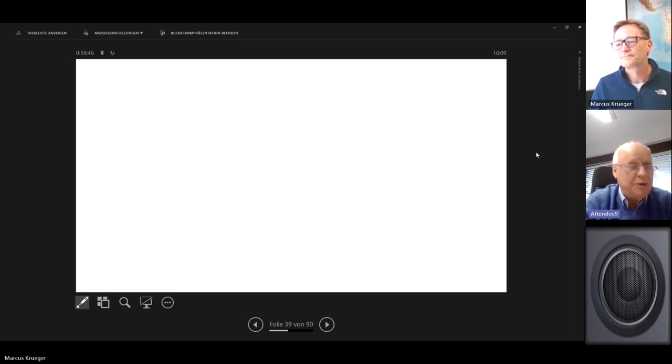For me, somehow new, because I'm not so much in the field anymore, is the flooding. That's a really nice experiment which you can do with the flooding approach, a special type of SILAC application.